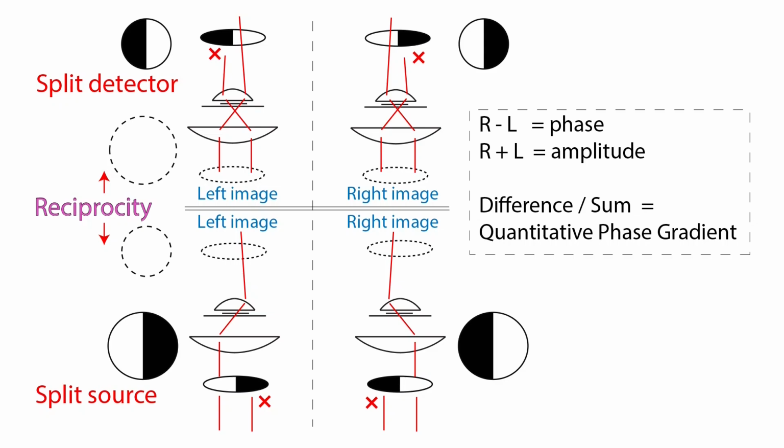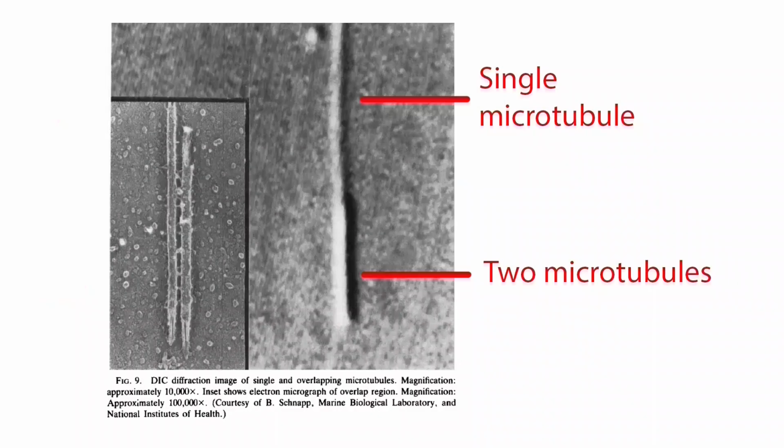Half masks and other masks can be used at either the condenser or the Fourier plane for an equivalent effect via a principle of reciprocity. Methods such as single half masking can benefit from digital image enhancement, where contrast tonality is weak and or where white background dominates in the image.